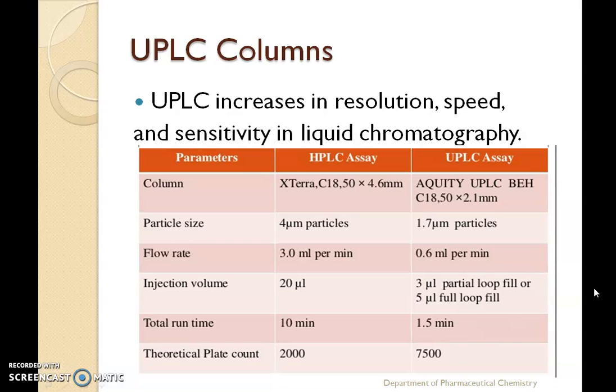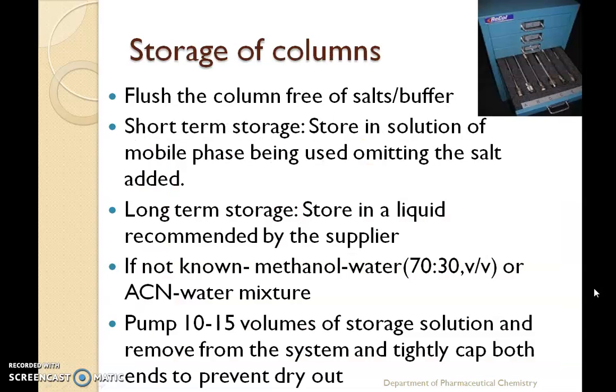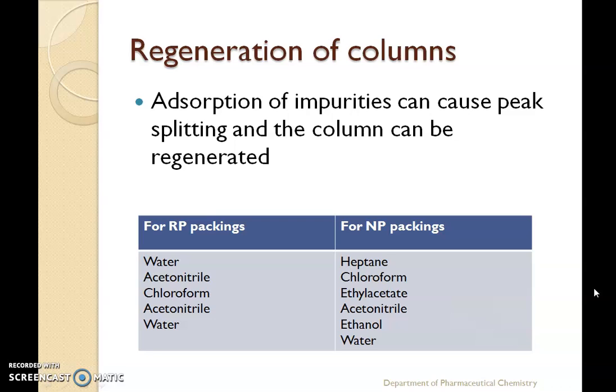And very important is the total run time. Suppose you give a total run time of 10 minutes in case of HPLC, when you apply the same method to the UPLC it takes only 1.5 minutes. And theoretical plate count is 2000 in case of HPLC, and it can be increased in case of UPLC. Regeneration can also be done in case of the column.